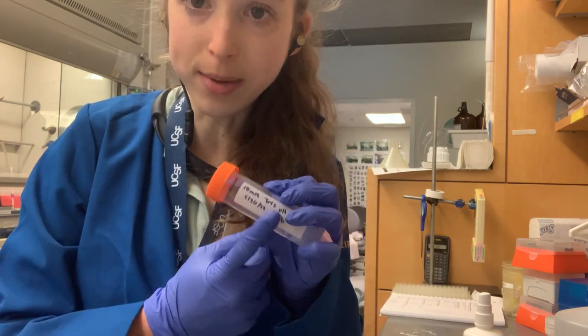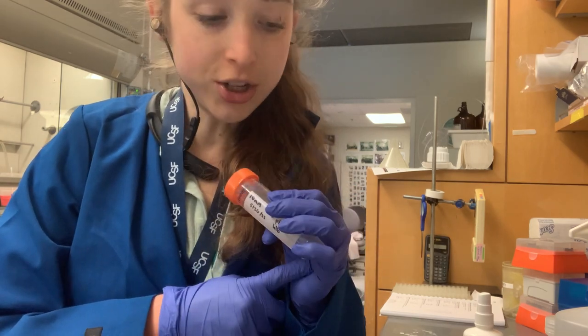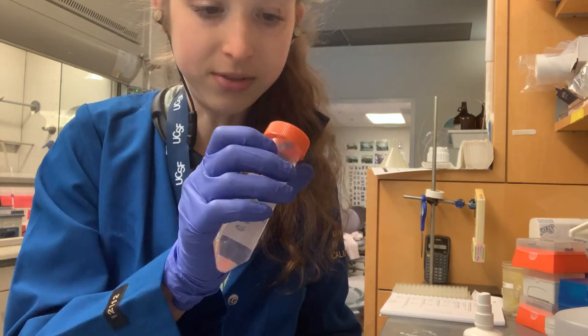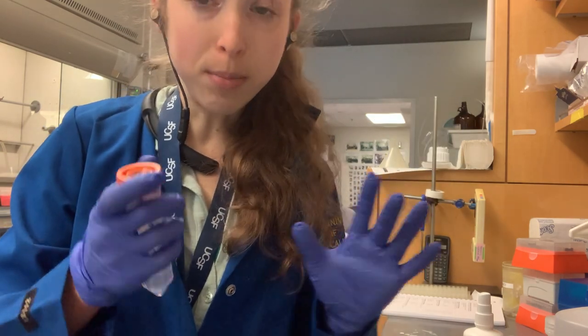On the side of the tube, you put all the information like the date, your initials, and any other information you might need. It's a lot easier to do this with flat lids, but we have these domed lids too, which apparently have a better centrifuge seal but drive me crazy.